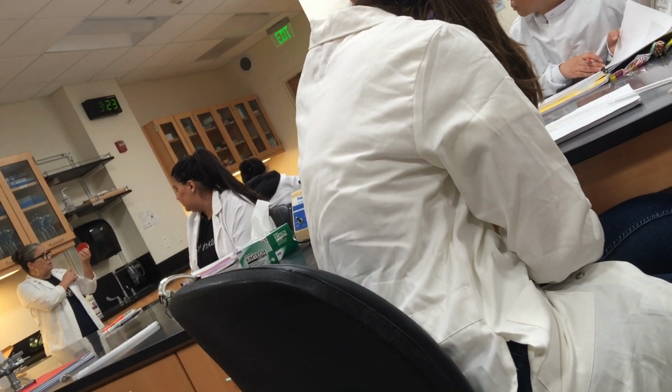Now, when I do this, I label it with just a pen. So I look at there and I go, what do I say? And then the date, and then I put the organism, which is just my cough, who knows what it is, right? And then media would be blood agar. And notice I write just along the outside rim of the agar, right? Because I don't want to write all over the bottom and then I can't see what's growing there. And then I take it inside and I incubate it and I come back and I get horrified because things grow in my throat. But hey, guess what? Microbes are ubiquitous. They are everywhere, right?